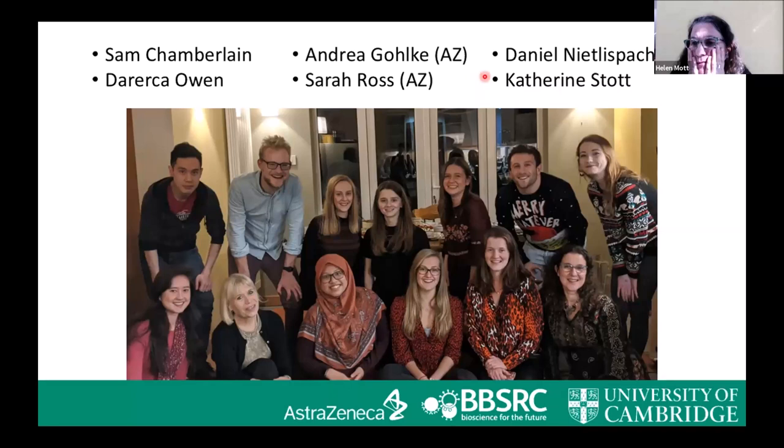It's a good question, because obviously we never really had a 2-to-1 complex. We always assumed we only had one RAL per face of the disc, because we thought there probably wasn't enough space to have any more, given that we were using the smallest nanodiscs, the MSP1D1, so about 10 nanometers. But basically, using normal TROSY, no deuteration, we could pretty much see everything apart from the very weak peaks. So I can't tell you an exact line width change, but it really didn't look as bad as that. I think it's flopping around on the disc, and you can see that from the chemical shifts as well, so it's not attached strongly enough to really get very broad.